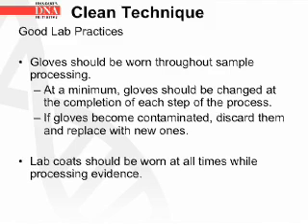Here are some good lab practices with respect to the clean technique. Gloves should be worn throughout sample processing. At a minimum, gloves should be changed at the completion of each step of the process. If gloves become contaminated, discard them and replace with new ones. Lab coats should be worn at all times while processing evidence.